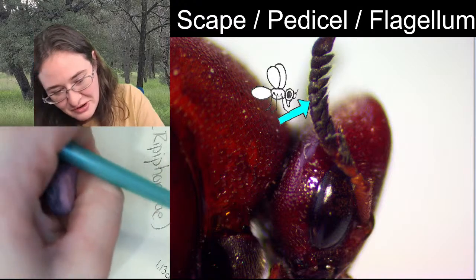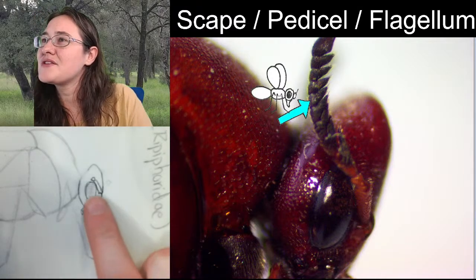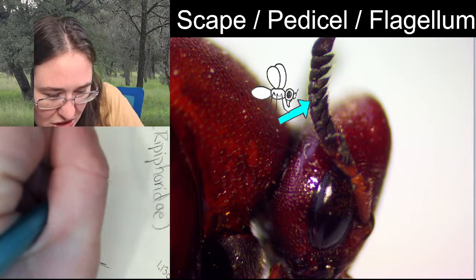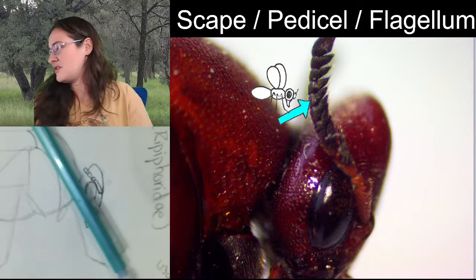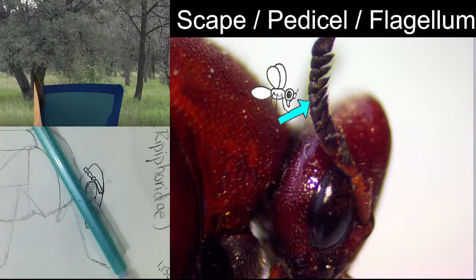We're going to be going up through here. All right, so the scape, the pedicel. It looks like the first two segments of the flagellum are a little bit longer. And then... yeah, oh, cool.